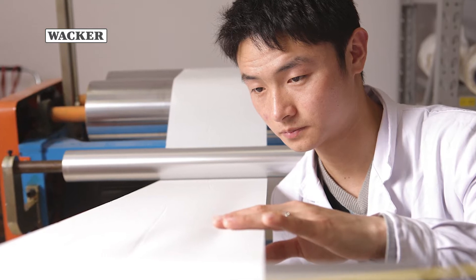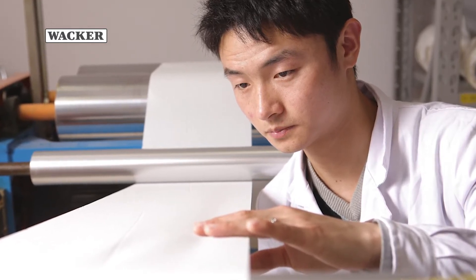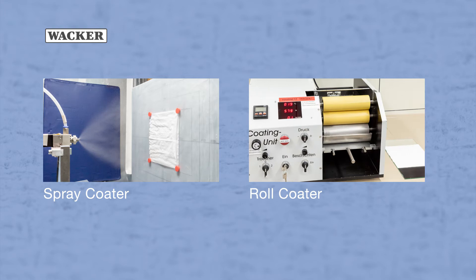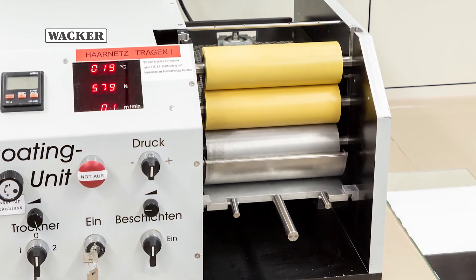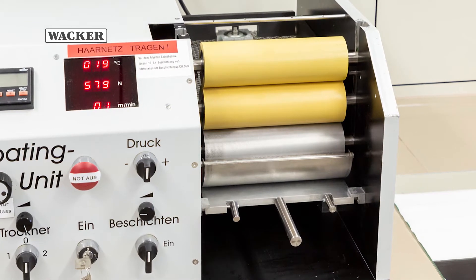In the tissue manufacturing industry, the tissue fabric is coated during the converting stage with products called lotions. This is done with the aid of spray coaters or roll coaters. In the laboratory we use a roll coater to simulate the roll coating process. This is a three-roll system. In this video we show how single-sided coating is done.